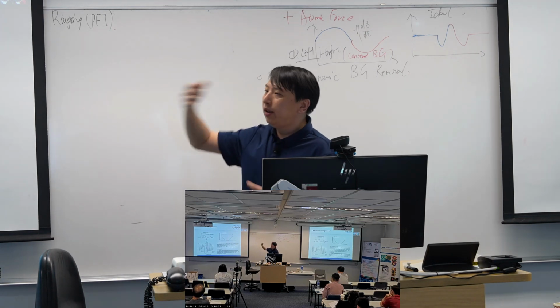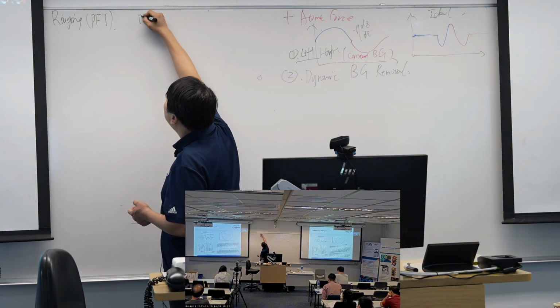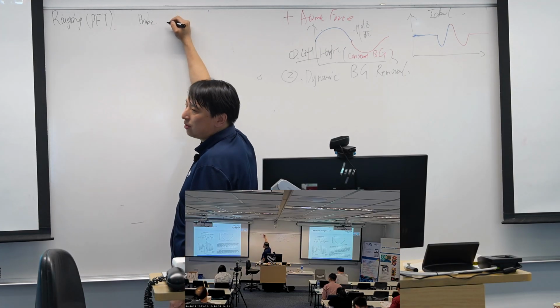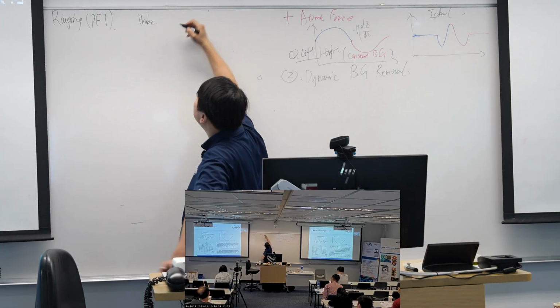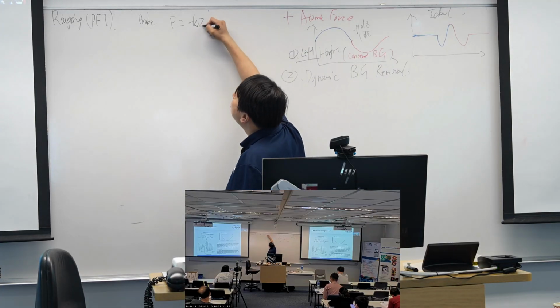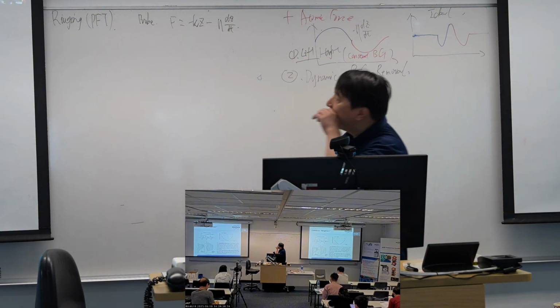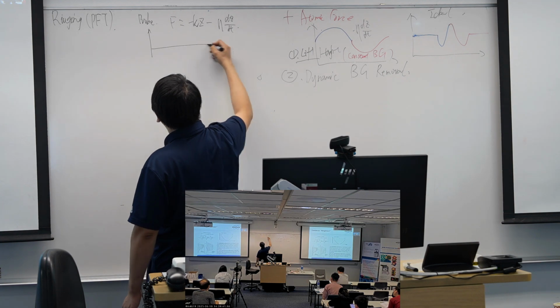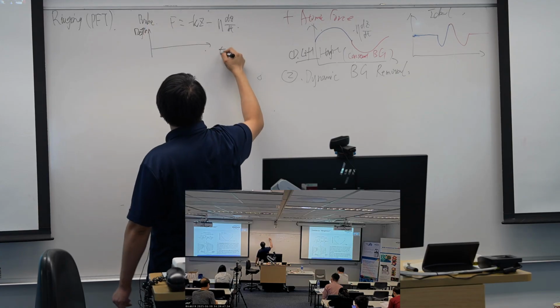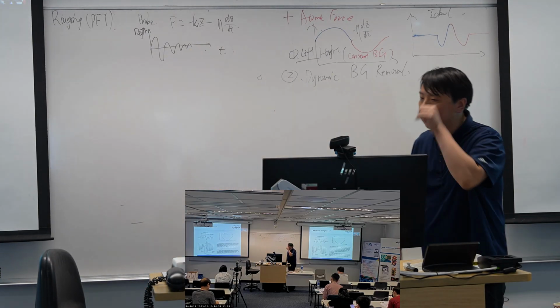And this ringing, let's go back to the morning session. When a probe exists in a viscous environment, we need to consider the hydrodynamic force. The force will be Hooke's law and the hydrodynamic force. And finally, we will get a damped oscillation, right? We will get a damped oscillation, deflection against time.